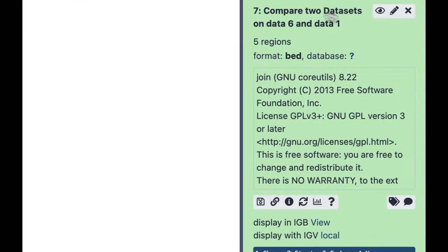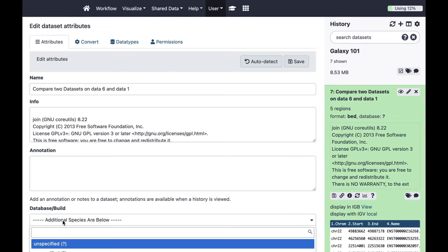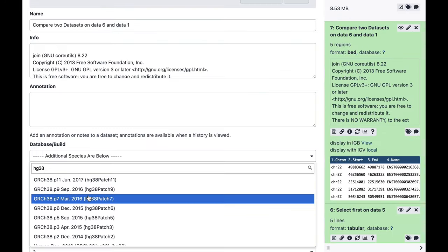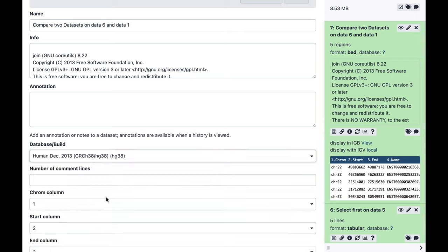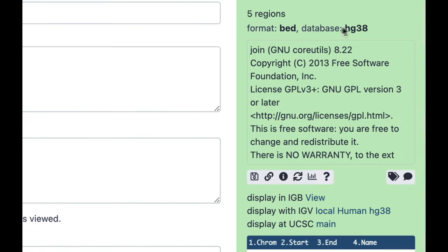To visualize in the genome browser, expand the dataset. Normally you'd see a 'Display at UCSC' link, but Galaxy doesn't know which genome version to use. We need to tell it this data is derived from human hg38. There are patches listed but we want hg38 proper. After clicking save, the database is set to hg38.